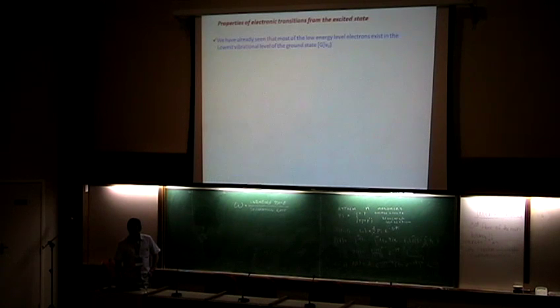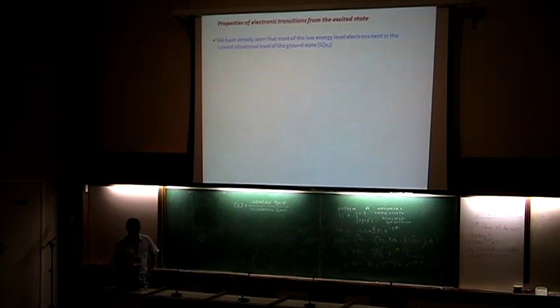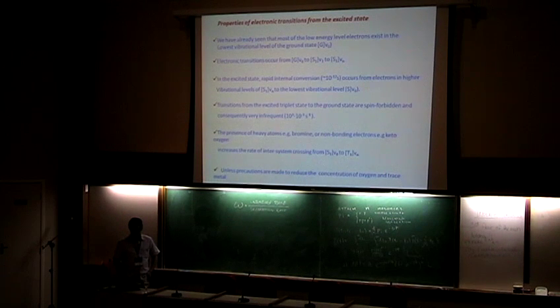So if we look, well, just going back. So most emission quenching, energy transfer, chemical reaction will occur in this window. So you can use fluorescence to measure polarization, for example, measure rotation of molecules, proteins, and macromolecules. You can measure the distance between donors and acceptors, looking in this window. So I'll go past a little bit more.